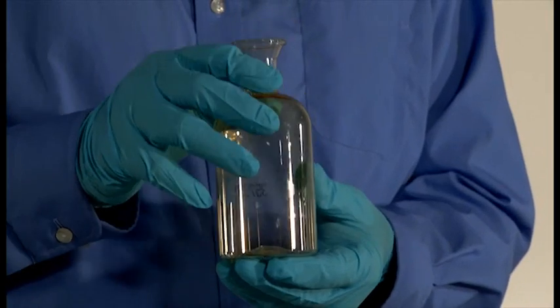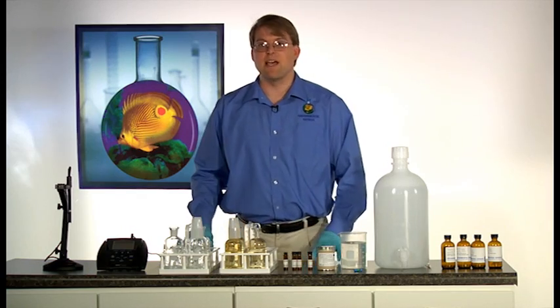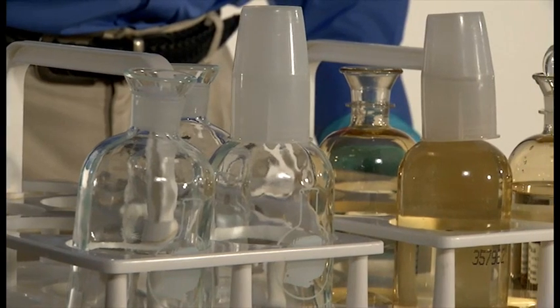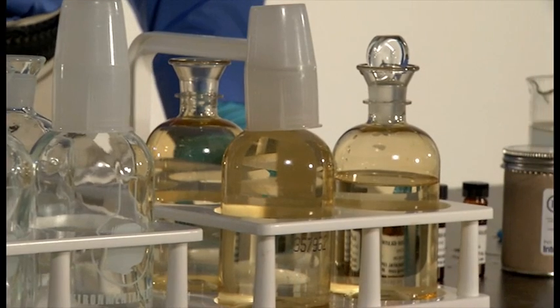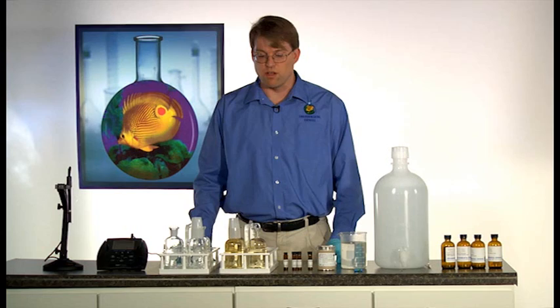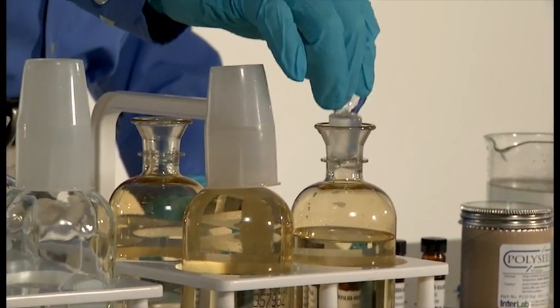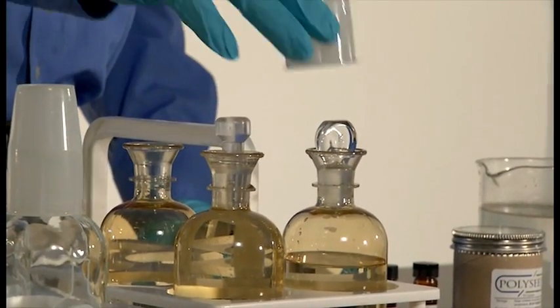The bottles are manufactured with a special coating on the inside to prevent the migration of oxygen through the plastic and also prevents the leaching of oxidizable materials into your samples during incubation. The plastic bottles fit your standard stoppers and overcaps.